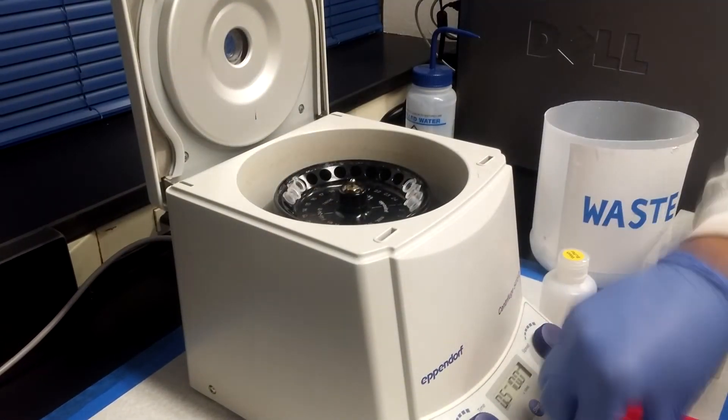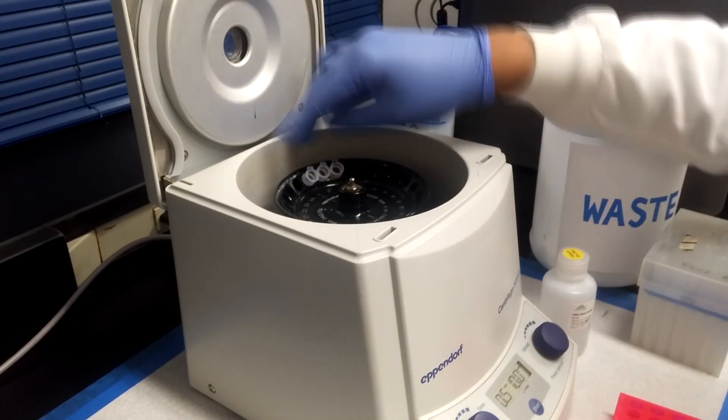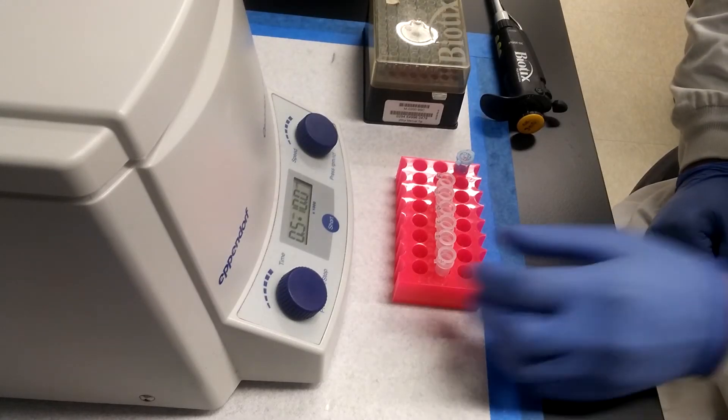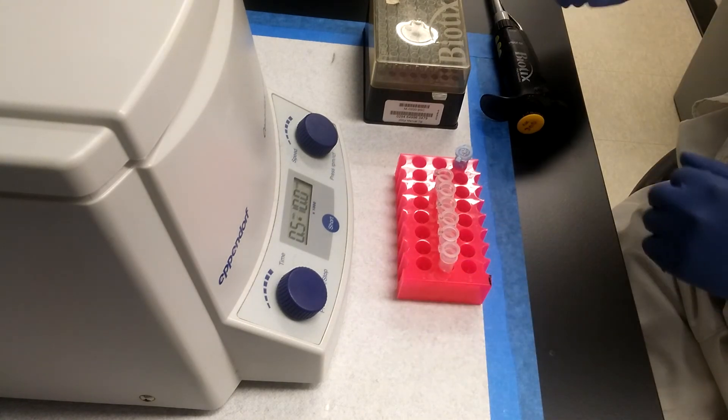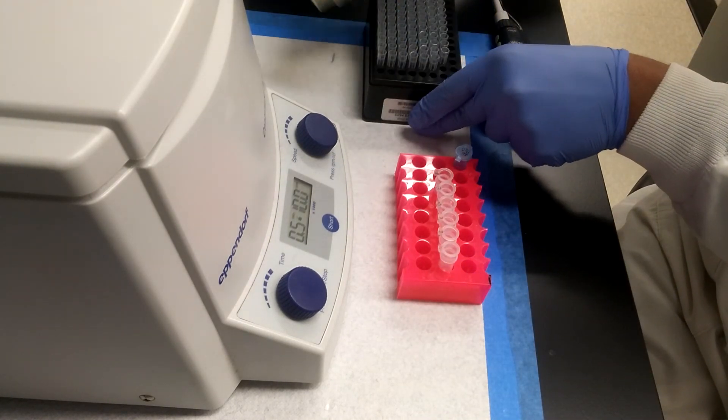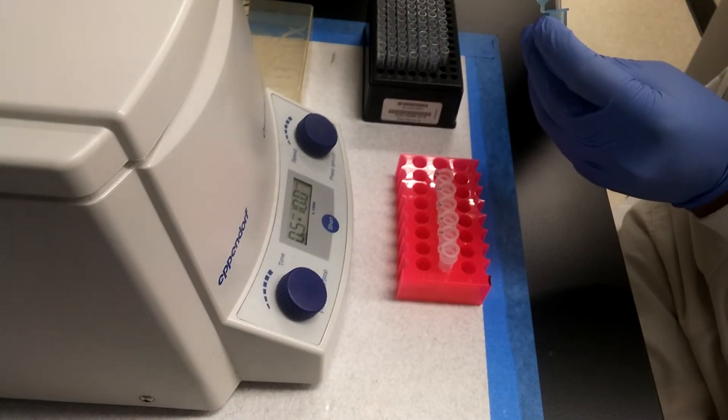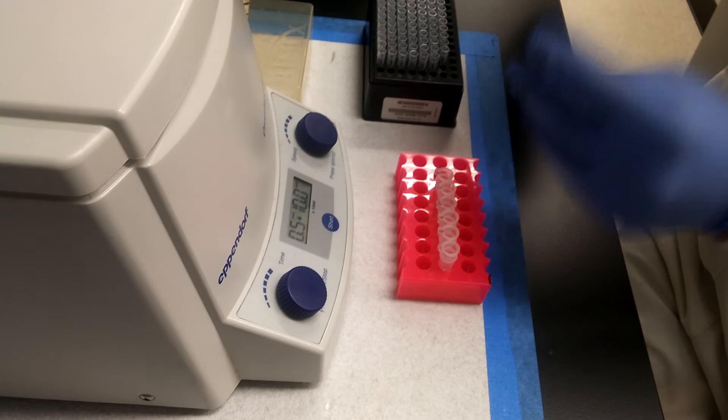After centrifuging, the collection columns can be discarded along with any buffer present in them. The filtration columns are then placed inside corresponding tubes PDNA A through F. 50 microliters of ultra-pure water are added to each column, pipetting as close to, but not touching, the filter.